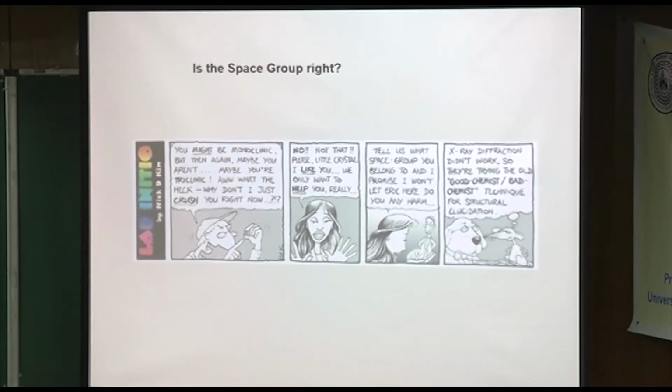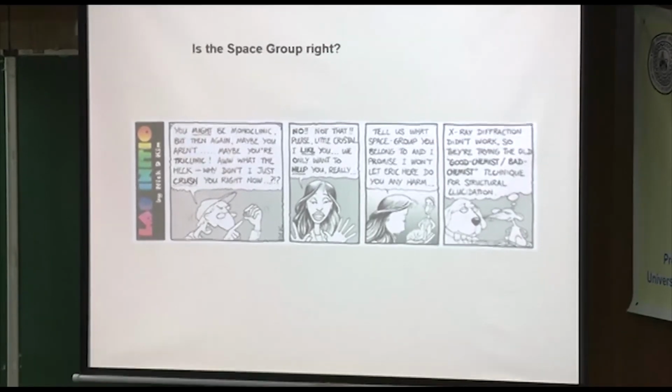Okay, so tomorrow I'll have some examples of ways to grow crystals, but if you have other ways to grow crystals, I'd like to hear them, so share your expertise with us all. I do think it's often just a matter of luck. But patience, care, all of these things are important. Don't try to grow crystals next to something that's vibrating, because you'll usually not be able to get big ones. Things like that, little tips, right?